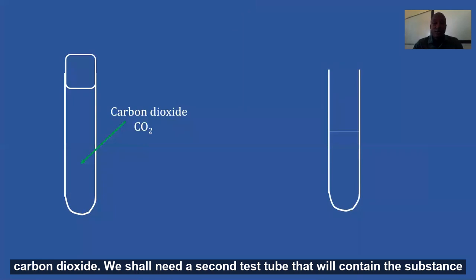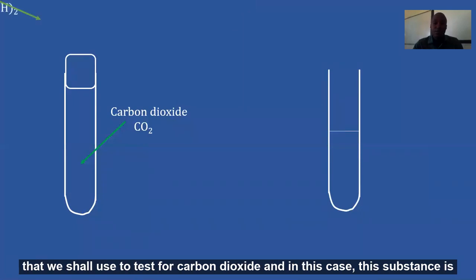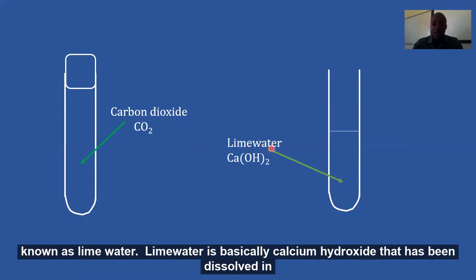We shall need a second test tube that will contain the substance that we shall use to test for carbon dioxide, and in this case, this substance is known as lime water. Lime water is basically calcium hydroxide that has been dissolved in water.